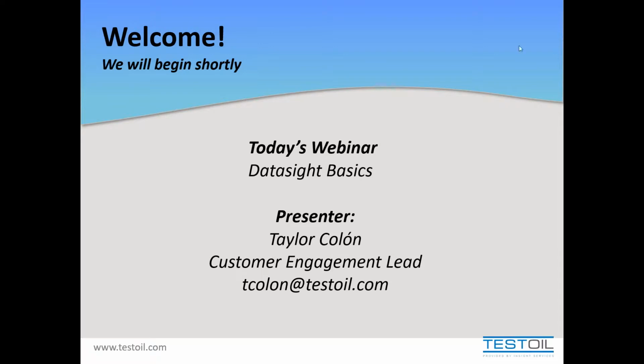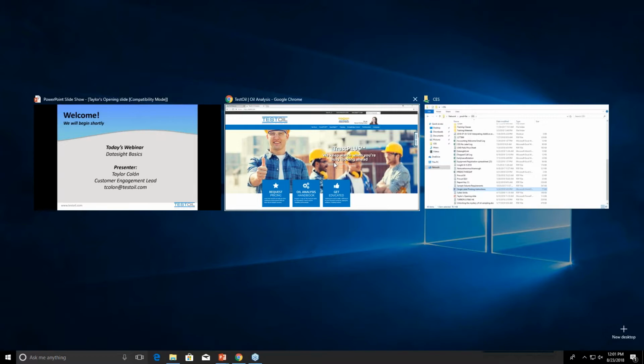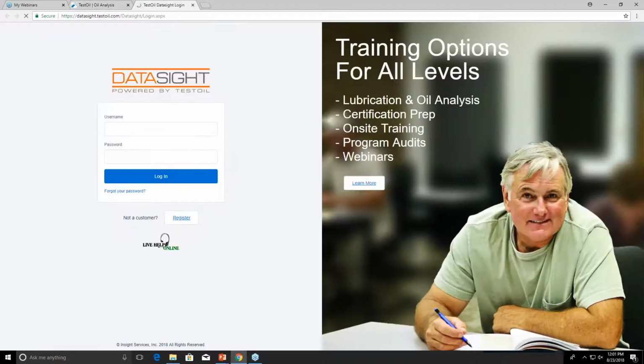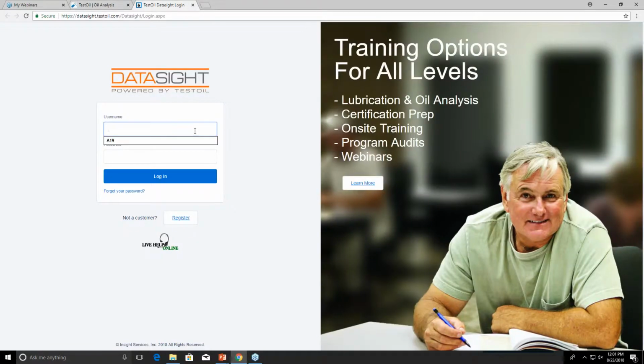So today's presentation is on the basics of utilizing Datasight. I'll go ahead and share my screen here. All right, so the basic how to log in. You go to testoil.com, and at the top corner here, you click on Datasight, log in. I'm going to go ahead and use our test login.